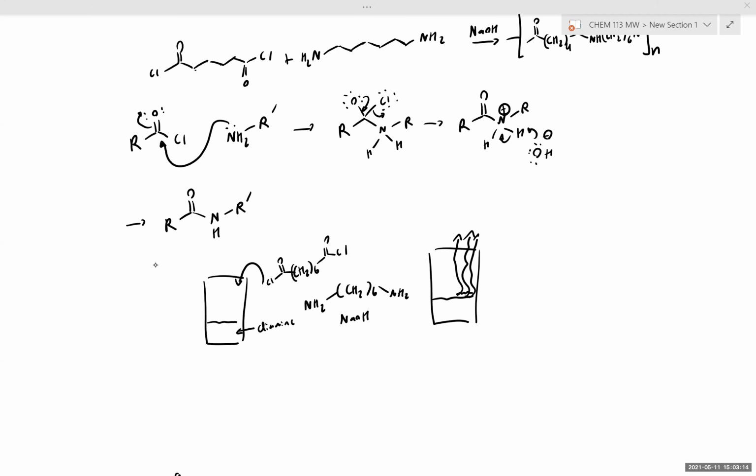It didn't work that well when we pulled it. We just mostly ended up with a glob or some short strands. But usually when we run this as a class, we end up with a few really good batches where students can pull strands that are almost the length of the lab. And that's just because the nylon polymer contains tens of thousands of individual nylon units.